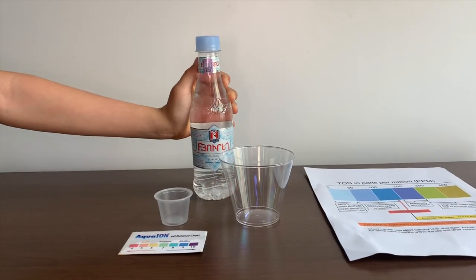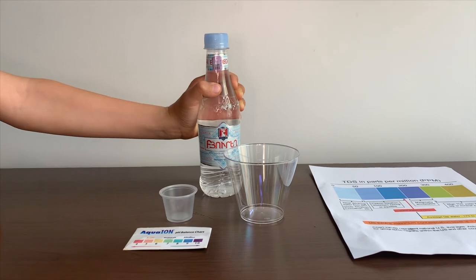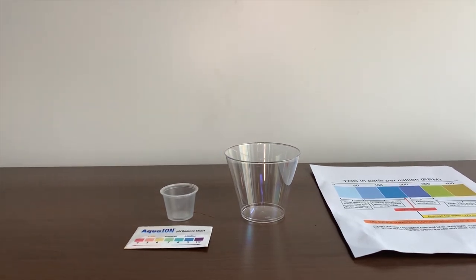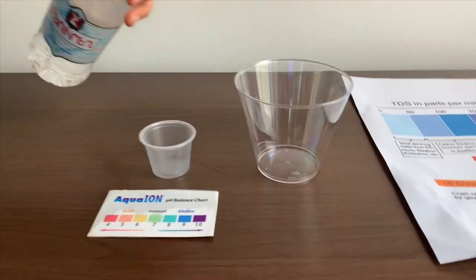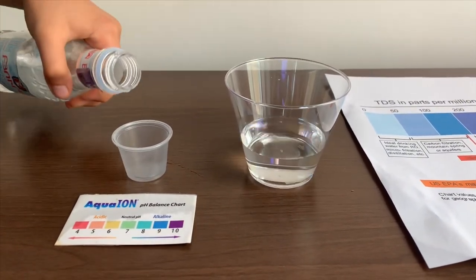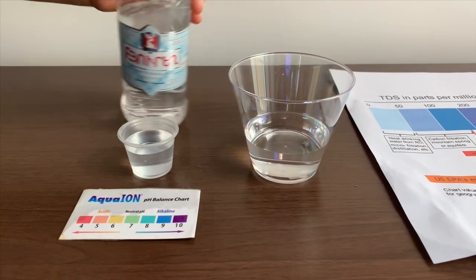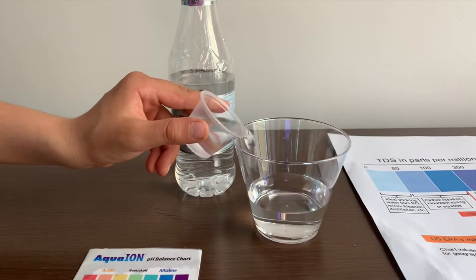This is butyl non-carbonated spring water from Arminia. Let's test the pH and TDS levels. Let's pour some water in. This is a little too much for the pH, but let's put some back in the TDS.